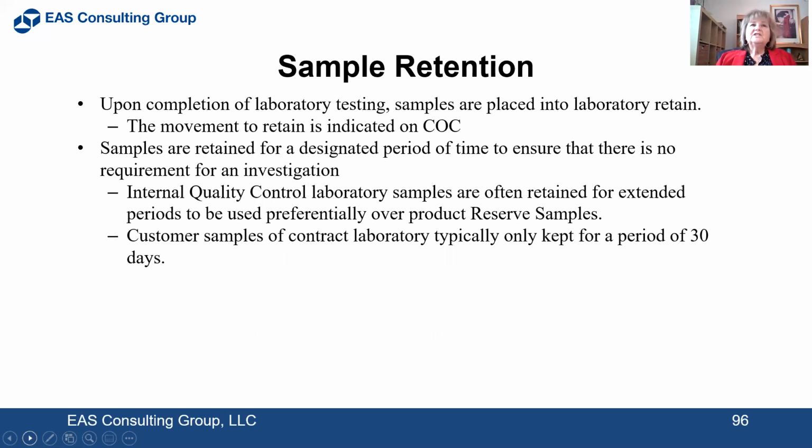So upon completion of your laboratory testing, the samples are placed into a laboratory retain. The movement to retain is indicated on the chain of custody. Samples are retained for a designated period of time to ensure that there is no requirement for an investigation. Internal quality control laboratory samples are often retained for extended periods to be used preferentially over your product reserve samples.